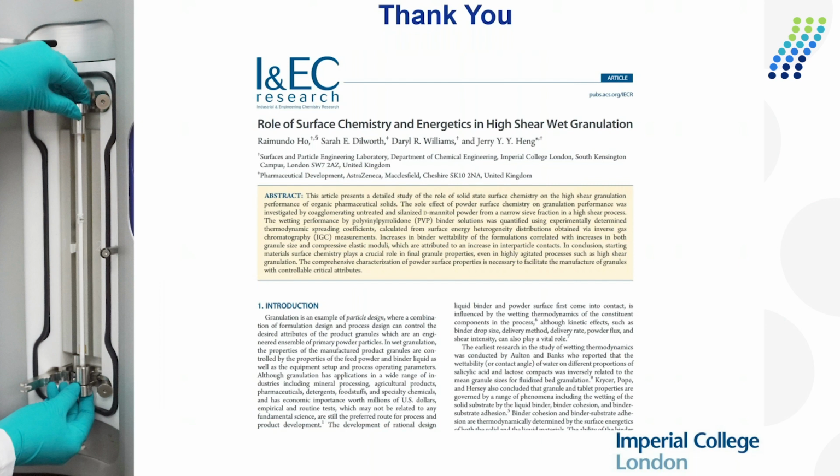Can this concept be applied to multi-component granulation? Yes, there's no reason why you can't apply it, providing you're able to calculate the surface properties of your powders individually or of your powder mixture. There's no reason why you couldn't use this approach to try to formulate in a more complex, multi-component space. Although I have to say we have not done that, I think, for example, you could use IGC to characterize the components that go into your formulation, or you could characterize the surface properties of some formulated powder mixtures. Either of those would get you there.